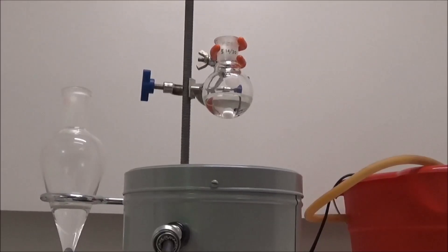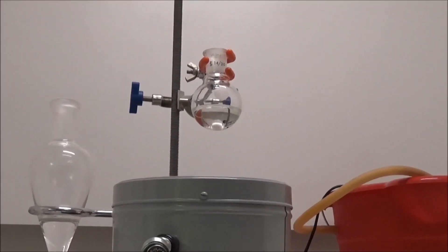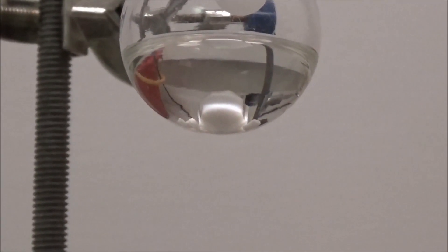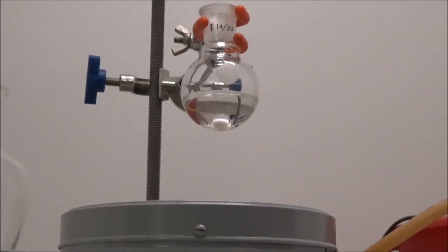The liquid was transferred to a 25 milliliter round bottom flask and a stir bar was added. Unfortunately, I spilled a bunch and got some calcium chloride into the flask.